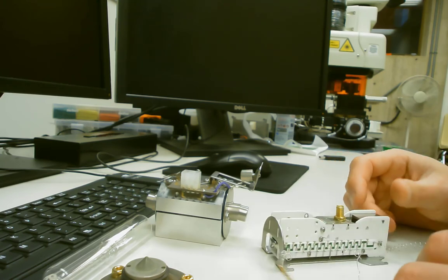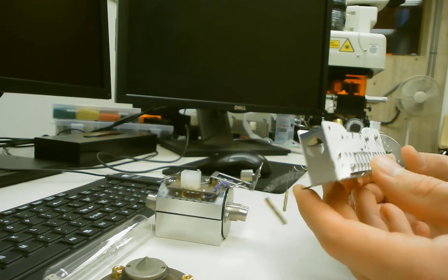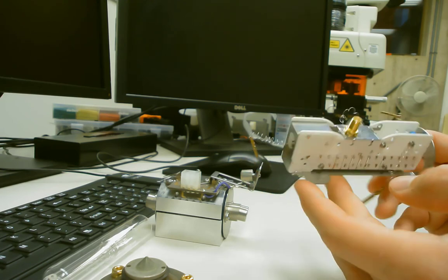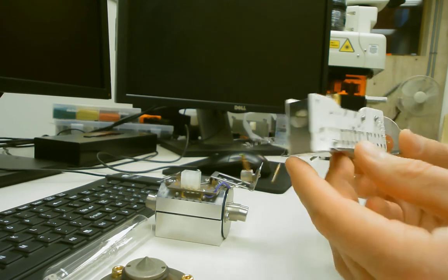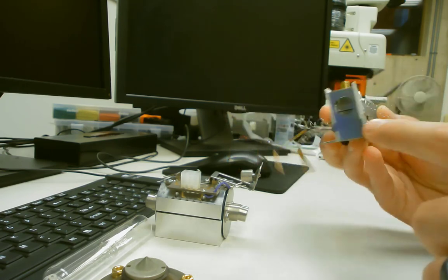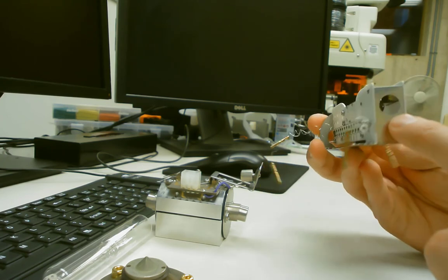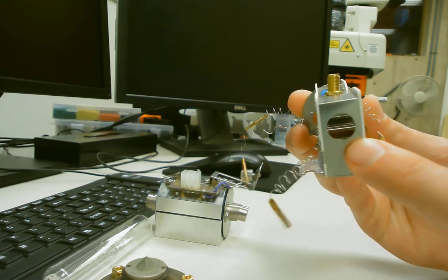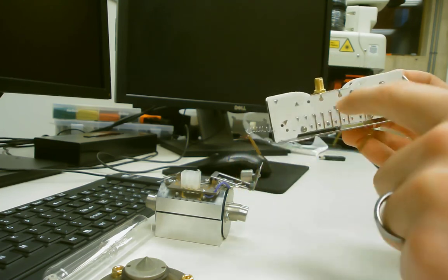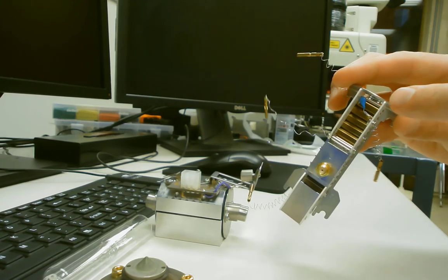But the quadrupole is our mass filter, which filters out everything to a single m/z ratio. And then this is an electron multiplier that does the counting. You can see from the top all the different dynodes. And then this is the hole where the initial ion comes in and strikes. There's a different colored plate there, and that's the one that the ion strikes and generates electrons, and then they cascade down for amplification down the different plates there.